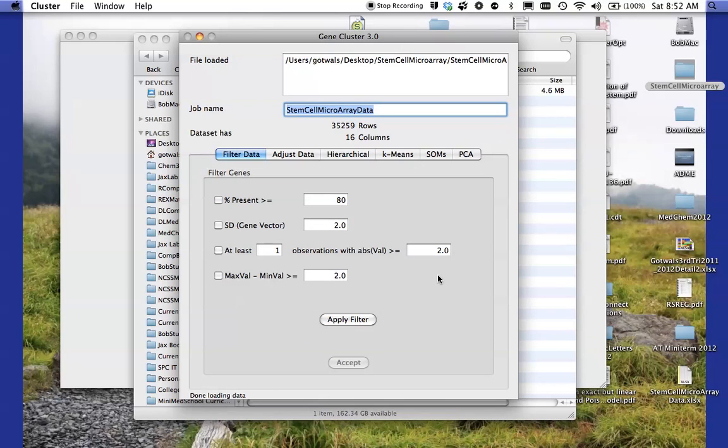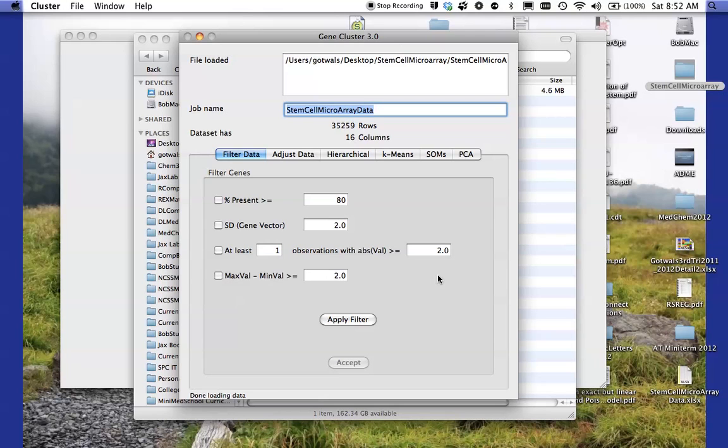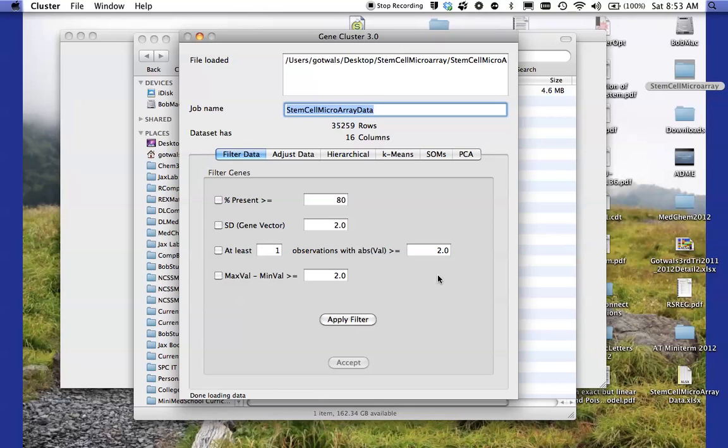What you should notice there is that there are 35,259 rows in this data set. Each row is a single gene and the 16 columns, excuse me 16 columns in this case, the first two columns and you should have looked at the data already in Microsoft Excel. The first column is the probe ID that's on the DNA microarray plate. The second column is the name of the gene and the next 14 columns are the 14 different cell types that we'll be investigating in this particular activity.